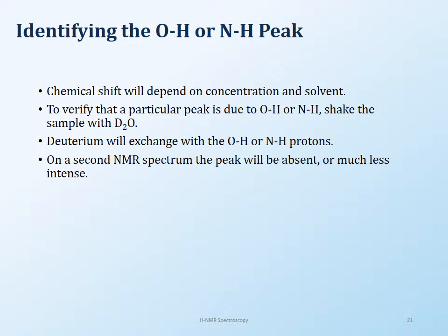The best way to tell whether you have a hydroxy peak or an amine peak, of course, is by exchanging it with D2O. I mentioned it before also. You put deuterated water in it, and then you observe if any of the peaks has disappeared in your NMR. So you take the original sample, then you add D2O, and then you take the NMR again, and then you see if anything has disappeared. And so that will tell you whether you have a hydroxy or an amine peak.